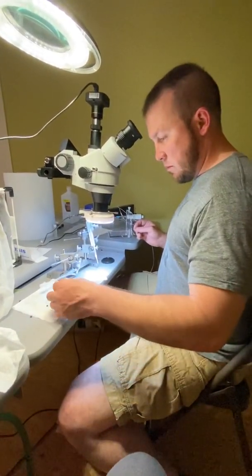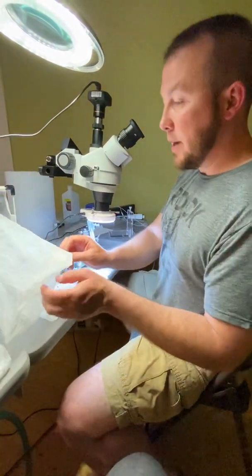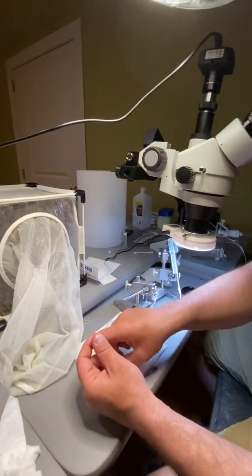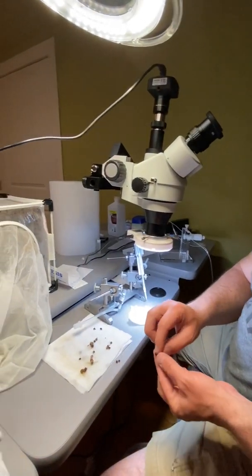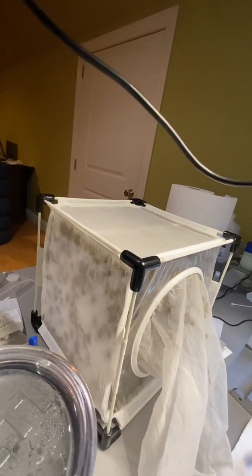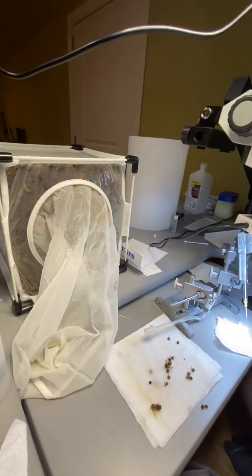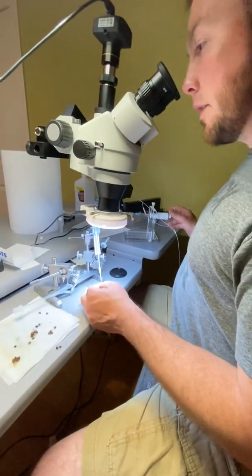We are collecting semen from honeybee drones for artificial insemination so that we can tell who the baby daddy is. Otherwise it's random. These are all drones from my colonies that we tested with Harbo's VSH assay and they're all high-scoring colonies. I don't know, maybe a thousand — we've got quite a few, it was a good catch.